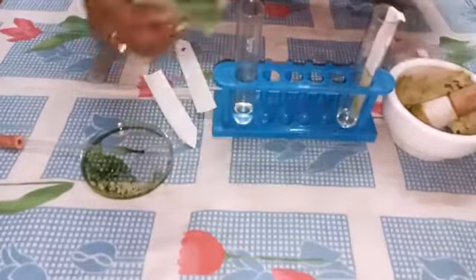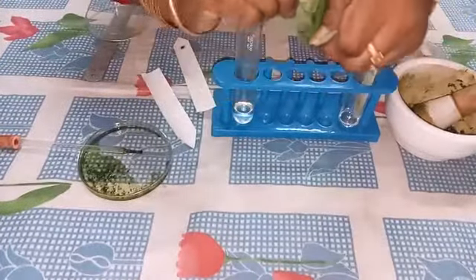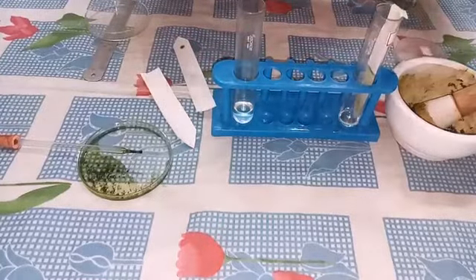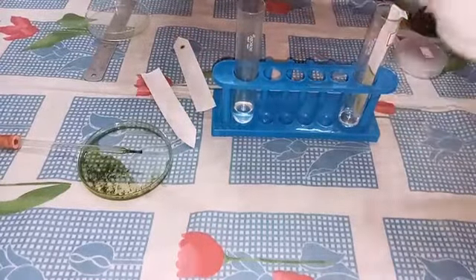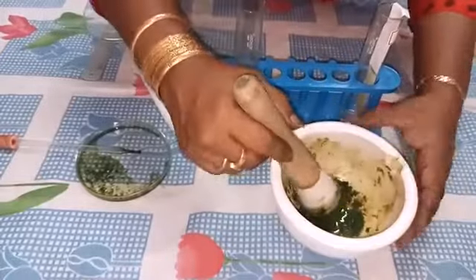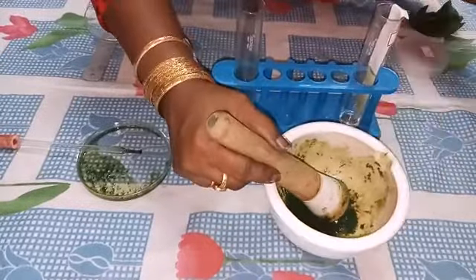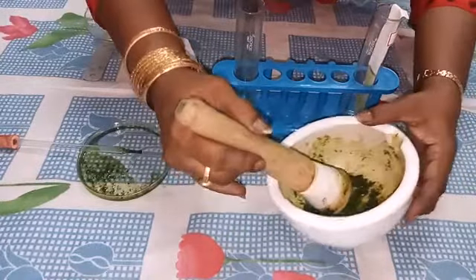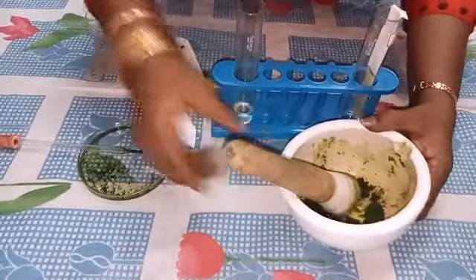First we have to take the leaf and tear it into pieces. Then we have to grind the leaf in the mortar with a little sand and acetone. After grinding, we can take the extract.